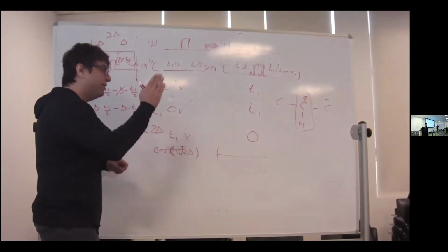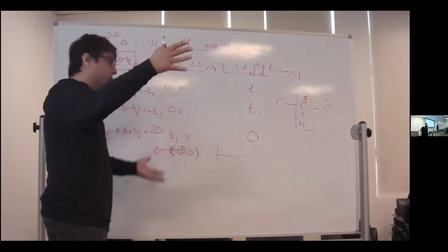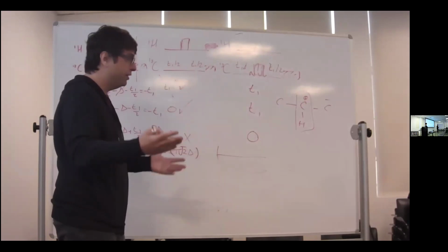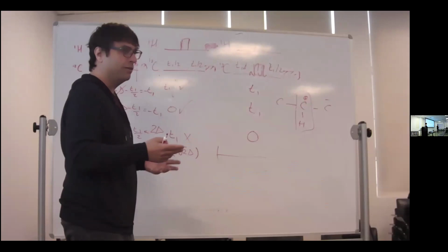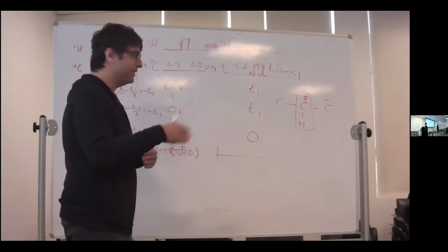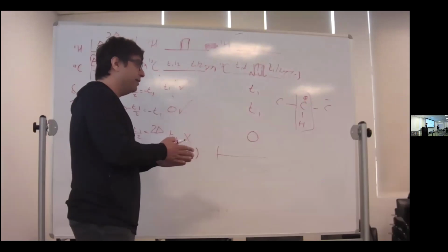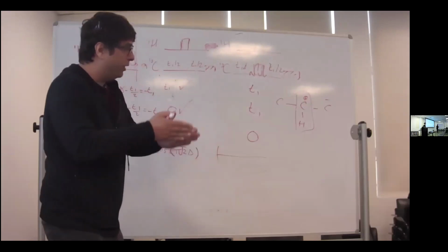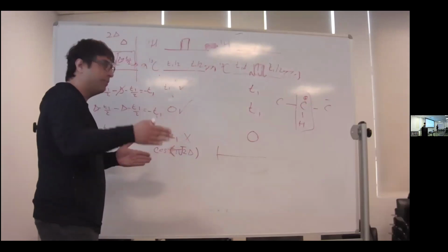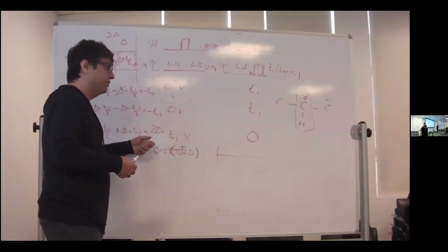So you increment T1: T1 is equal to 0, T1 is equal to something depending on your spectral width. You go into the spectrometer, you set your spectral width, you tell it how many increments. What is that called in Bruker? ND? Is it called ND in Bruker? So you go in and you set up, and that determines the dwell time. Every time you're incrementing T1, there's a new value of T1. And when you're recording a particular experiment with a particular T1 value, the evolutions will be given by this.